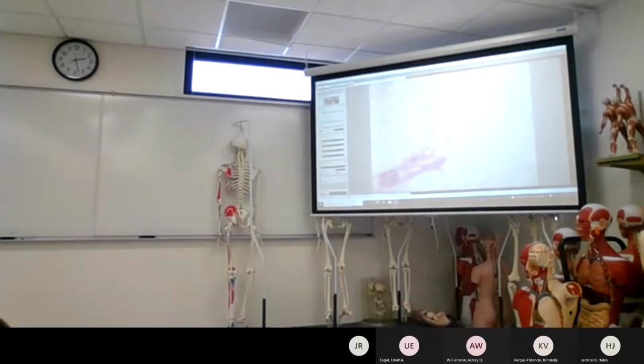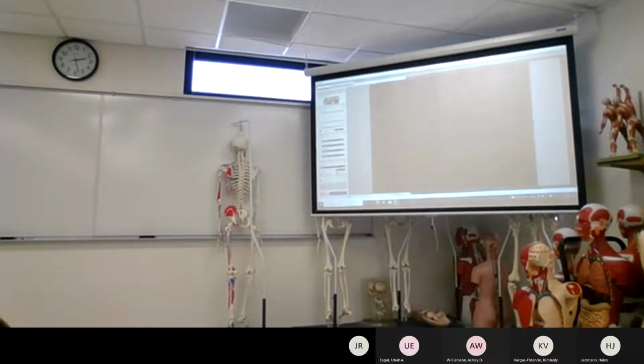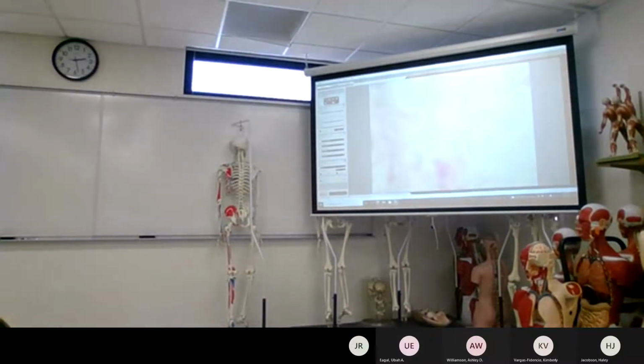And when I do an image, I like to try to grab one so you can see a little bit of blood vessels.